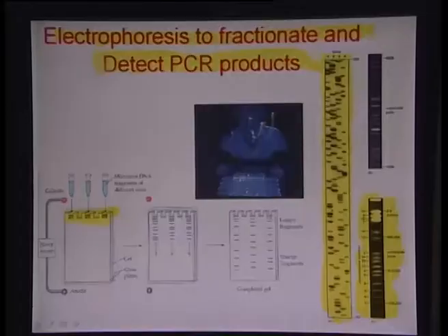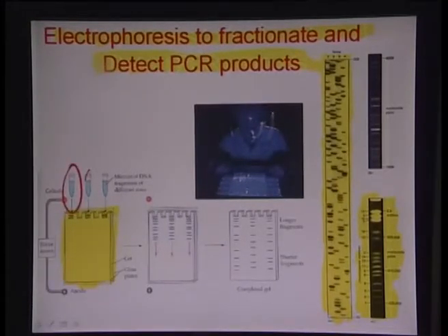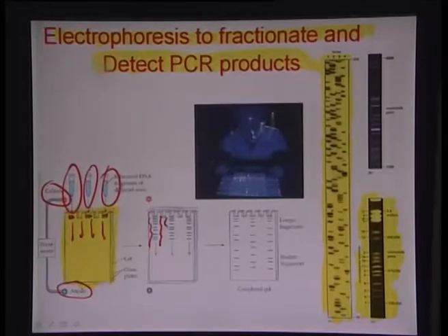So the way you do it in a laboratory is that you prepare a gel material with pockets, something like this, and then you put the mixture of DNA fragments of different sizes into these pockets. As you can see here, the DNA is being loaded onto the gel. This is also known as loading the DNA, okay, at different points here. And then you have an electrode set with an external power supply which applies a voltage, making this side the anode and this the cathode, so that the DNA gets pushed and starts translating electrophoretically towards the anode. And you can see these bands start developing after a while as the DNA moves through the gel.